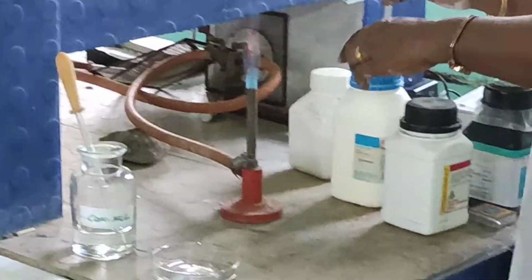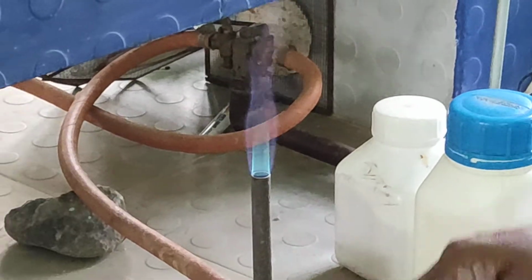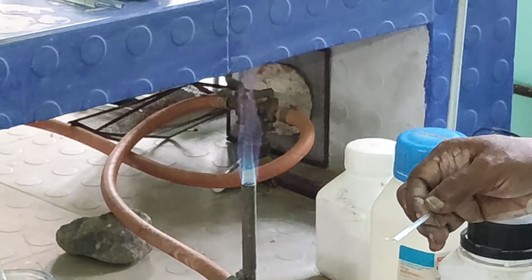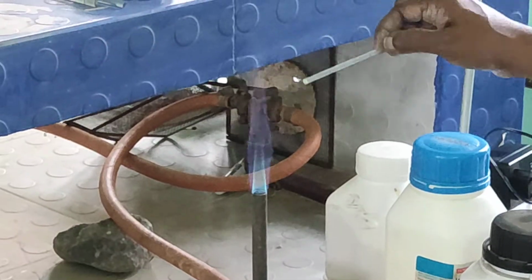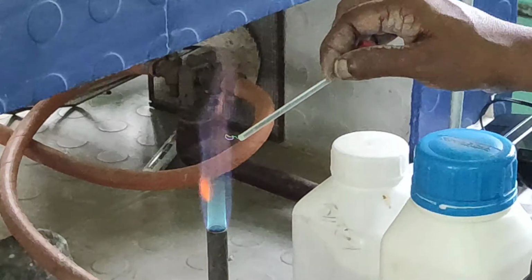Now you see the flame. The flame is not having any color. Now I am testing whether this salt carries some ion of our choice. So now I am showing this.